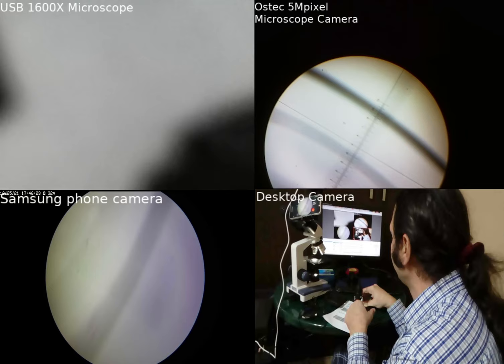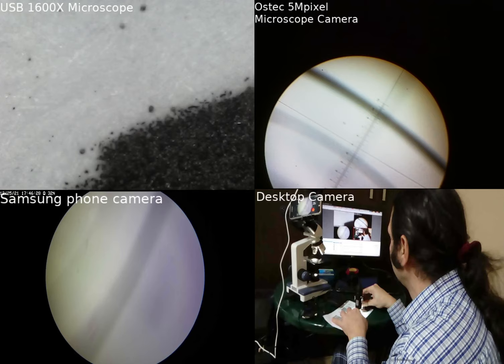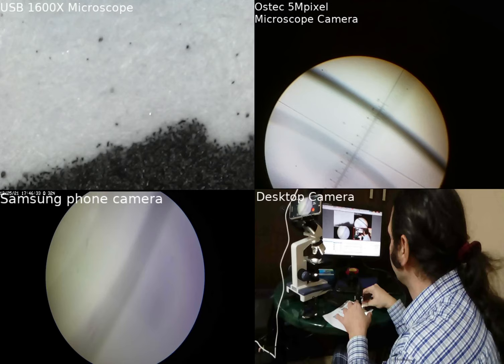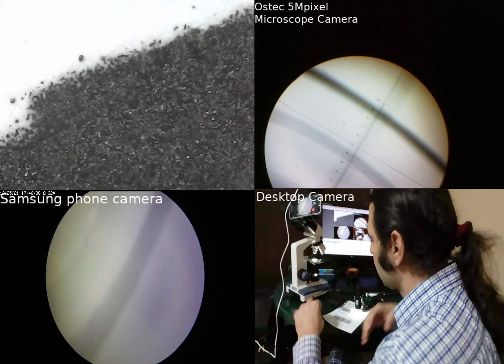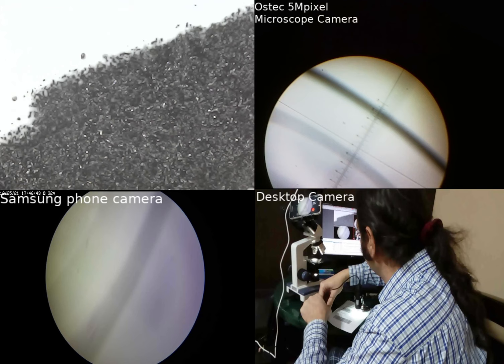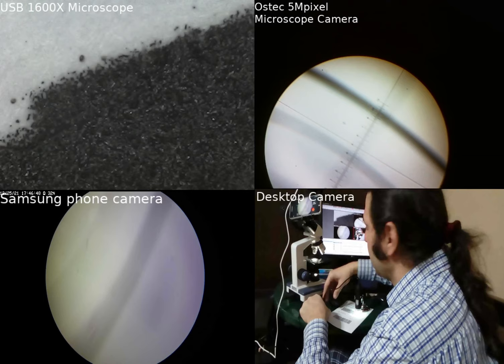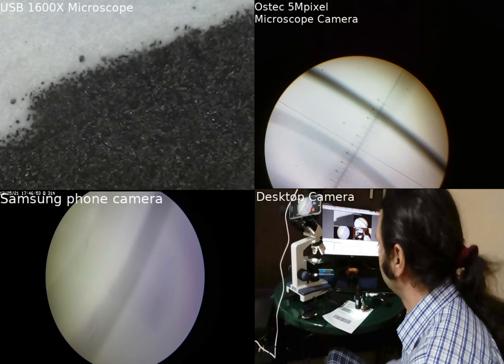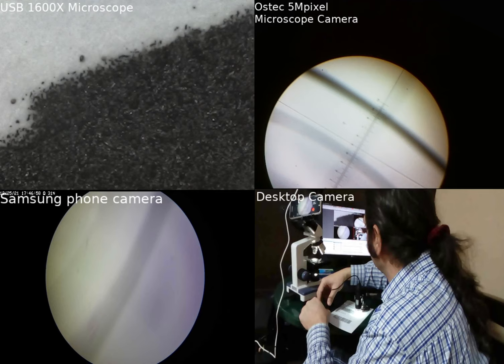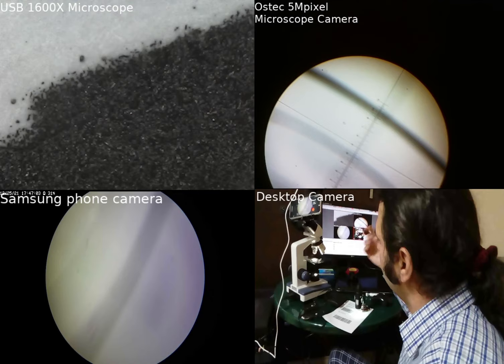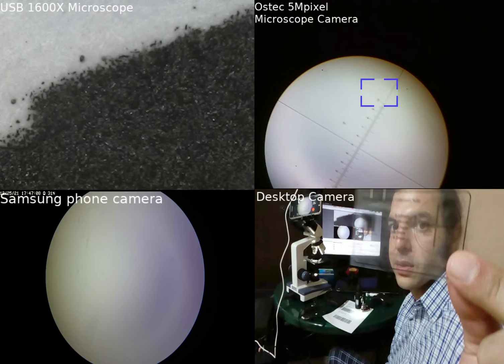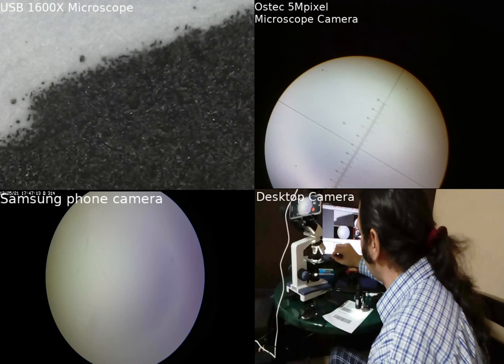You can see the plastic part on the bottom. This more zoomed view was at 1600 times — but as you can see, it's not very clear at maximum zoom. The resolution of the USB microscope is limited — it's just a normal camera with a small objective lens, so clarity suffers at high magnification.